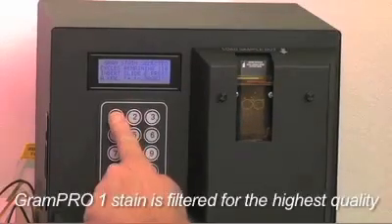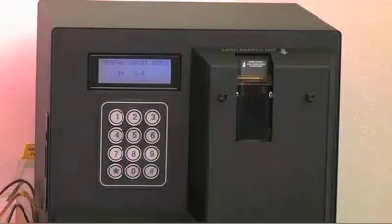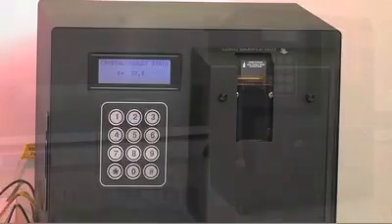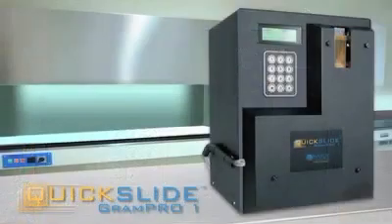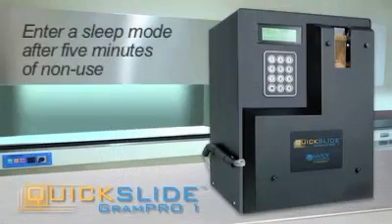The Gram Pro 1 stain is filtered for the highest quality. You will have beautiful Gram stains every time, no matter who does the staining. The Gram Pro 1 is energy efficient as well.